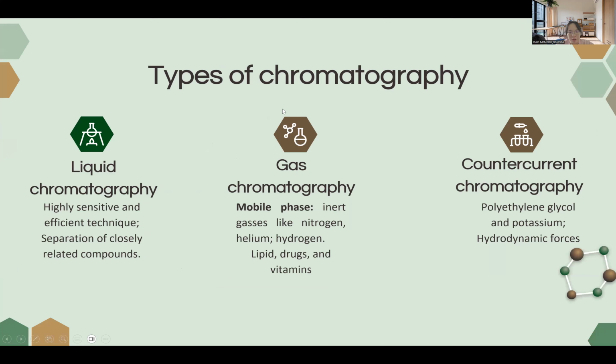There are many chromatography techniques that are suitable for bioanalysis. Liquid chromatography, particularly high-performance liquid chromatography, is a highly sensitive and efficient technique among the different chromatography techniques. High pressure ensures high resolution and better separation of closely related components, such as in protein separation and nucleic acid analysis.